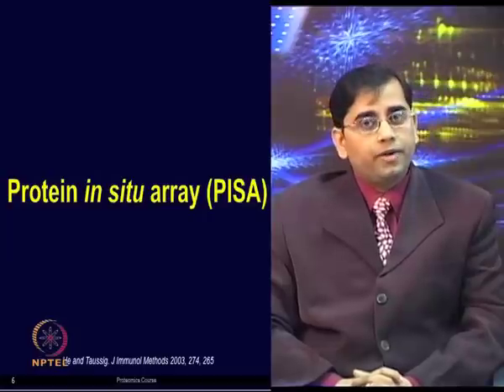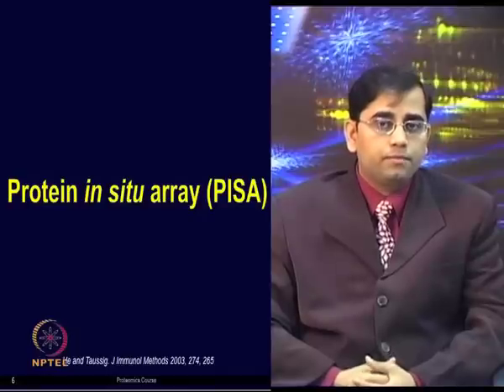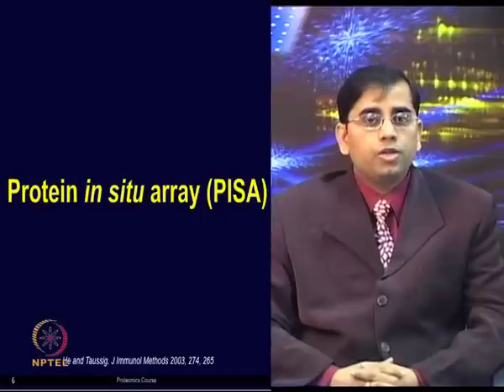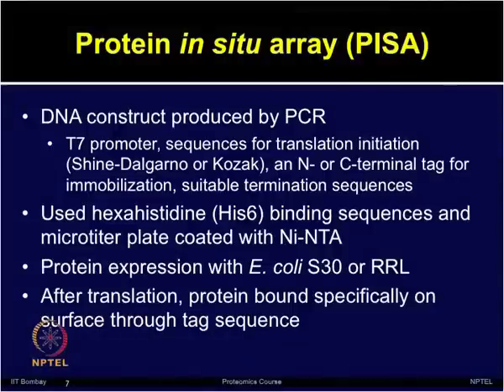The protein in situ array, which is also known as discrete array technology, provides a rapid single step method to generate protein arrays from the DNA template by using a cell free transcription and translation system, which is followed by the immobilization of the synthesized protein on the solid microarray surface. In the protein in situ arrays or PISA, there are various requirements.